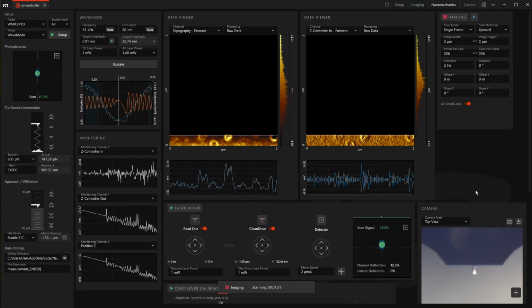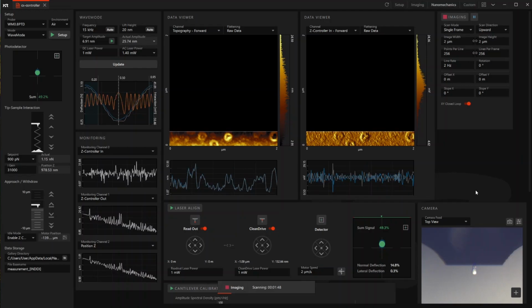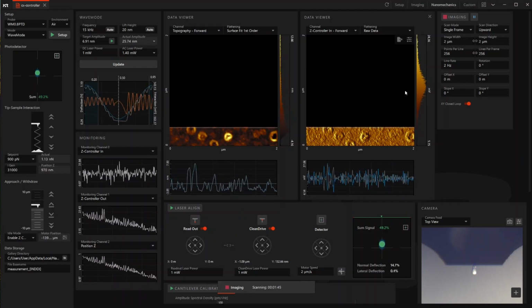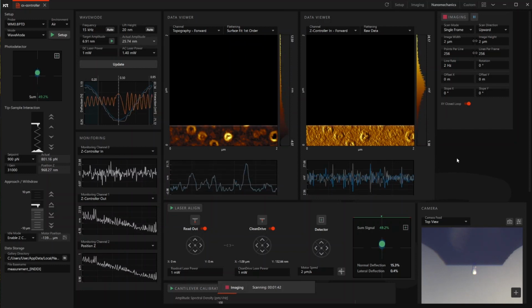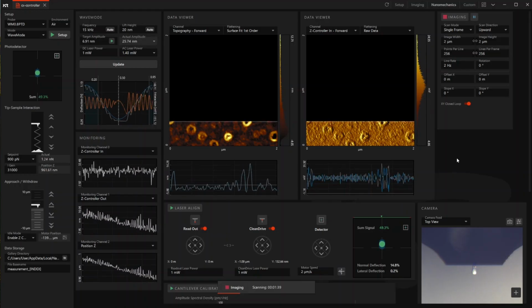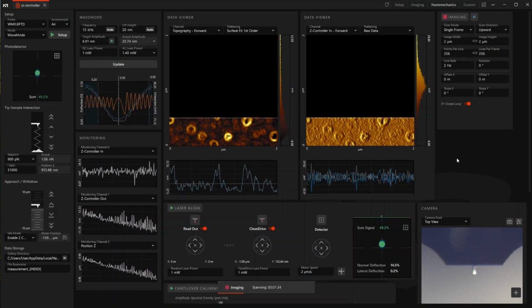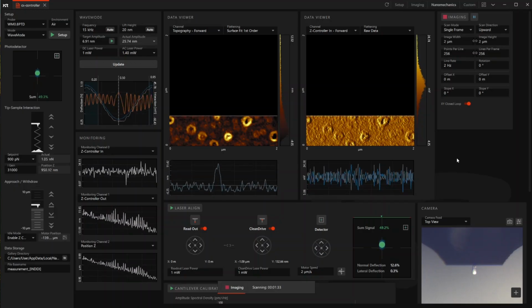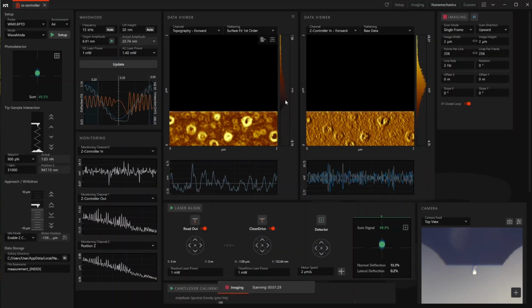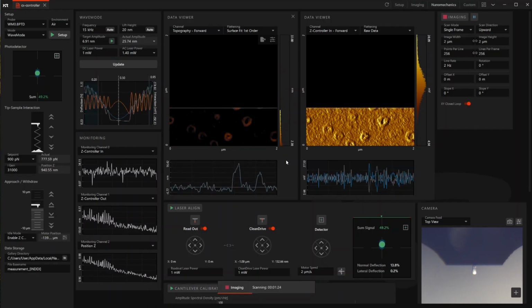And then here we can see the surface of the microscope glass slide, and it's full of craters. As we mentioned before, the borosilicate glass typically is passivated by putting it in acid to create this gel layer, which eventually develops into craters, which eventually develops in a passivated layer to prevent the hydration layer to reach ions in the glass and continue the degradation.